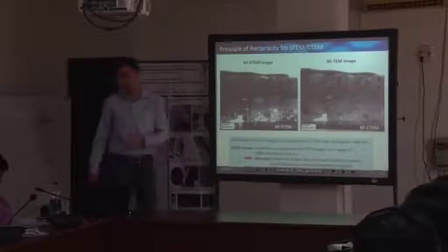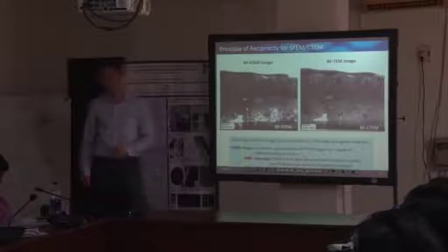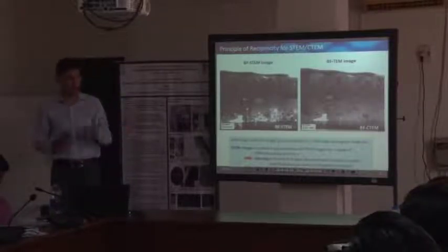This is what you want to have in Z contrast imaging: you want to have all these contrast features because you want to derive, in the best case, some quantitative numbers about the local density of your material.